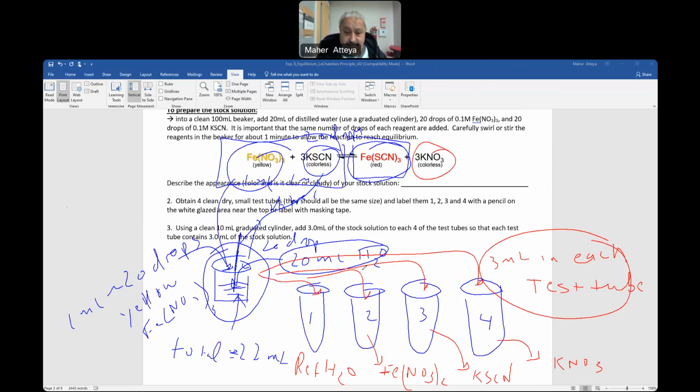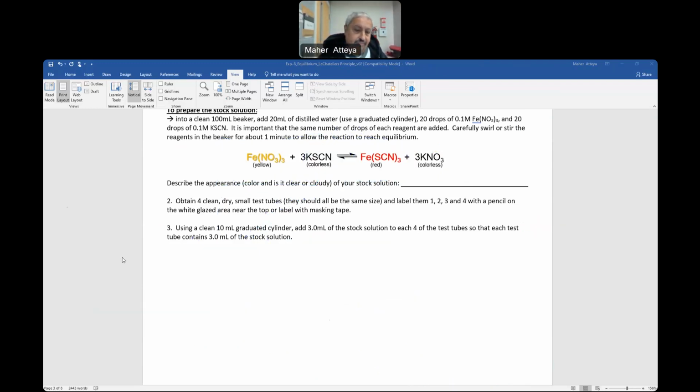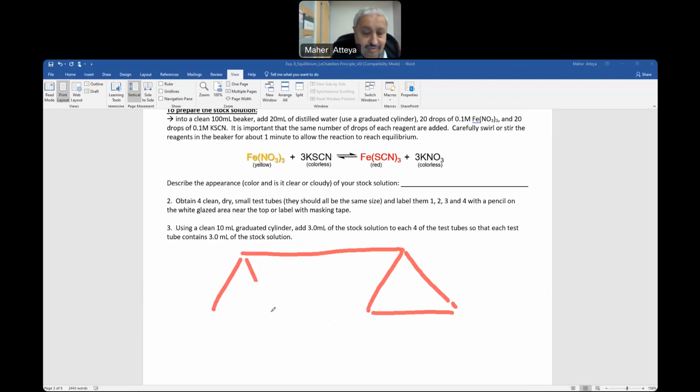It does not want to go down. So here it is. What will happen when I add H2O to this red mixture? So I visualize the whole thing. The chemical equilibrium is visualized as a balance with 2 arms. This is a balance with what? 2 arms.